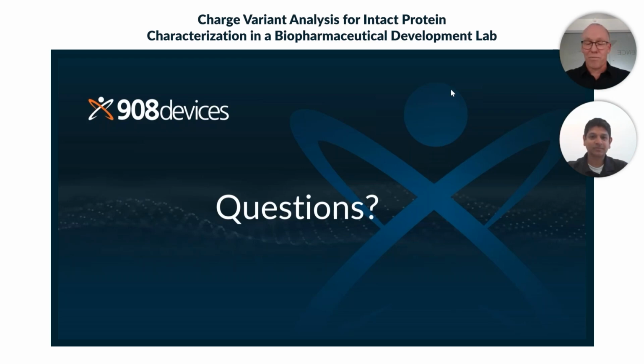Of course, and I said you can use stress studies to confirm some of the stuff. For instance, is it really a deamidation? Then you would stress it with high pH and see if that impacts your profile in both the ICE and the CZE. And you can do preparative ICE. There are tools out there for that. That would be another way to characterize those individual peaks. That is quite time consuming, in my experience, but there are tools out there to do that, the preparative fractionation with the ICE separation.